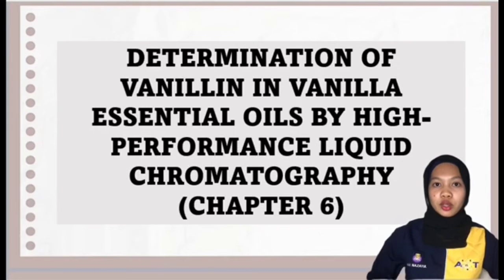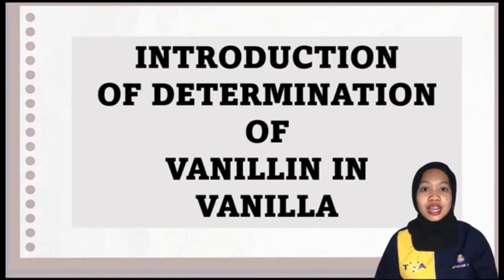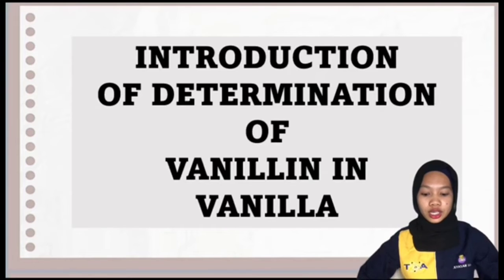Bismillahirrahmanirrahim. Assalamualaikum warahmatullahi wabarakatuh. My name is Aina Dato Balkis binti Roslan, and today I will present about the lab of determination of vanillin in vanilla essential oils by high-performance liquid chromatography in chapter 6. First and foremost, I will describe to all of you about the introduction.